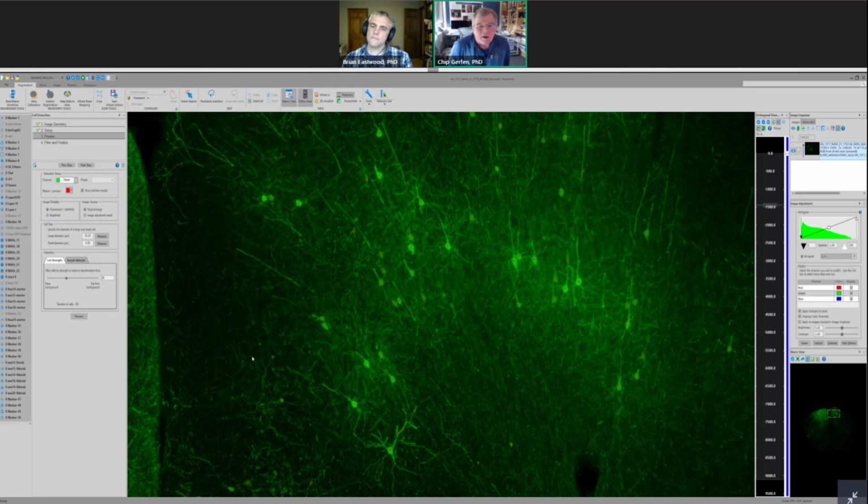This works fairly well. However, there are limitations. What we could do is go through and say, okay, we're going to pick the parameters of 25 and 8 for the range of the size of the cells, and a cell strength threshold value of 36. And then let's go over to another part of the brain.